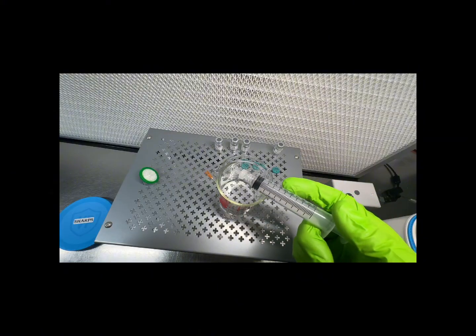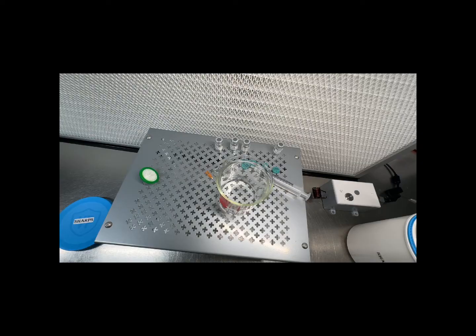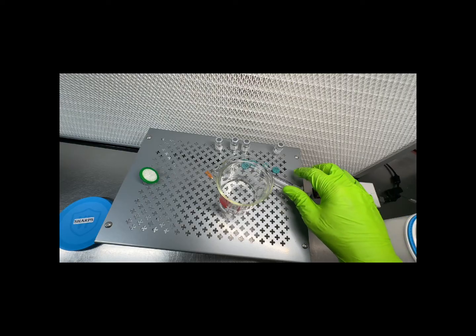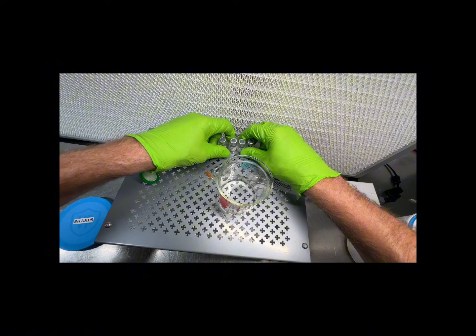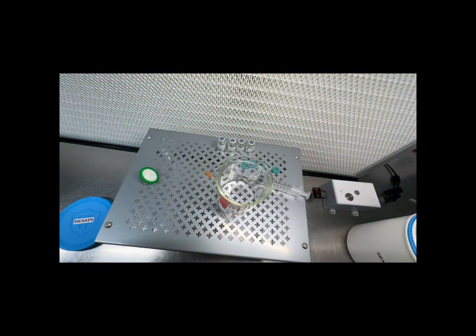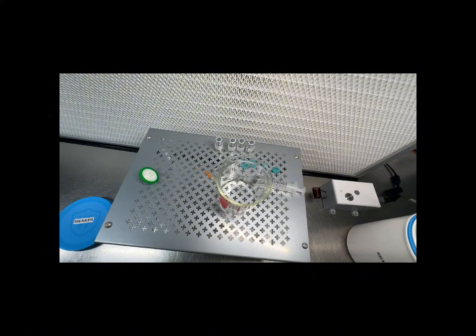Some other peptides may be more viscous, or I know that some are prone to cloudiness and gelling, and that may be an issue. But as far as tirzepatide, and molecularly, most of the GLP-1s are pretty similar, so that should be no problem to get at least 4 through there. If you get much beyond that, it may be worth considering a 13 millimeter filter. But I'd say 4 or 5 of just a GLP-1 shouldn't be any problem.